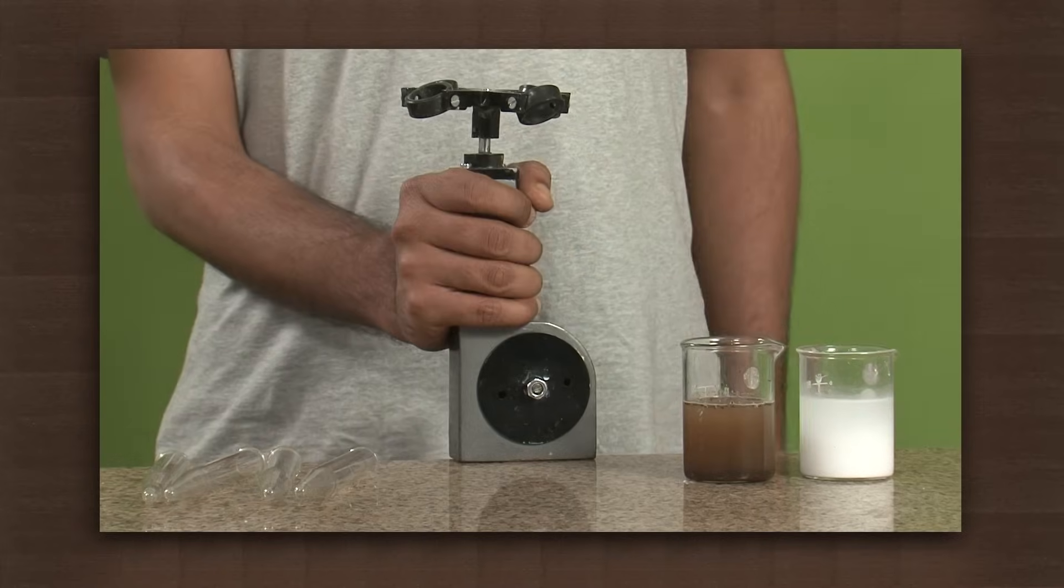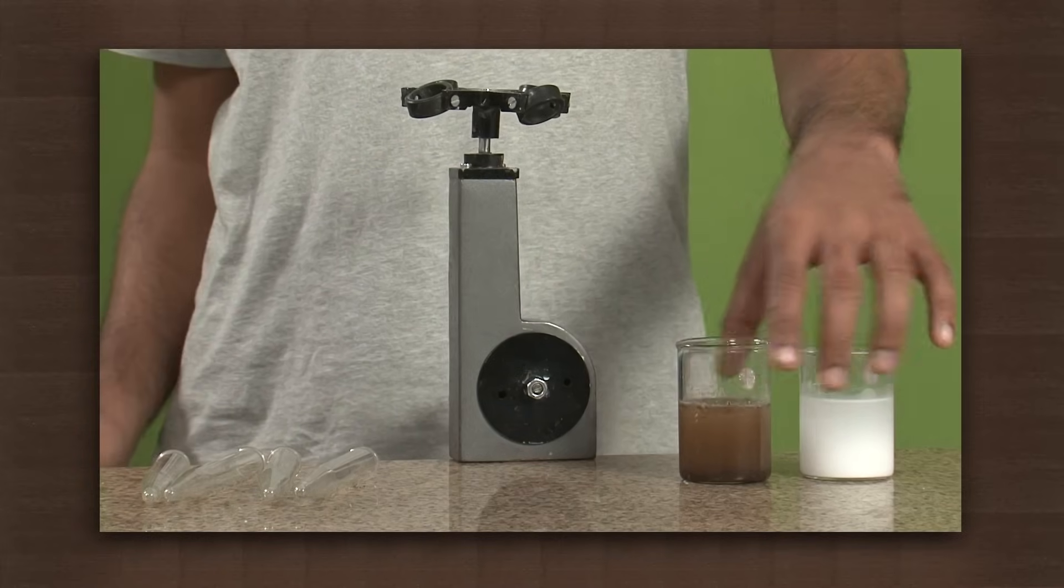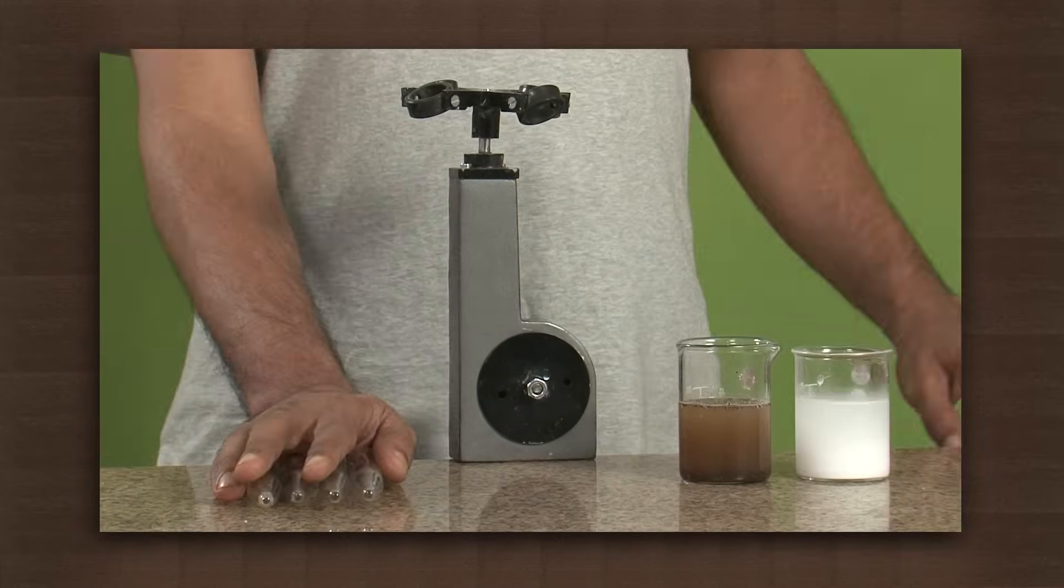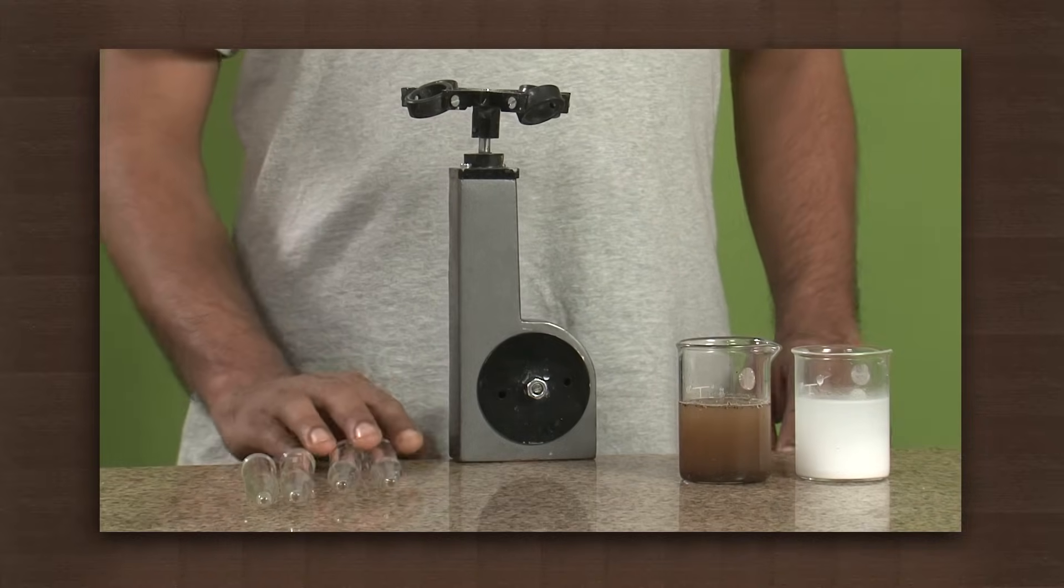For this, we need a handy centrifuge machine, muddy water, mixture of calcium carbonate and water, and four centrifuge test tubes.